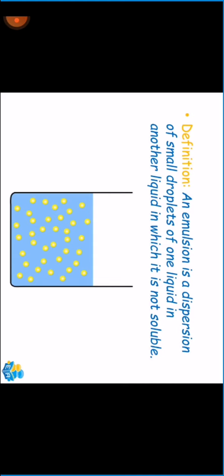It's also important to know the principle of steam distillation, and the principle of steam distillation is that a mixture of two immiscible liquids boils at a temperature below that of the boiling point of each of the liquids. The hot mixture of water vapour from the steam and the oil from the plant, or from the cloves that we're going to use, is passed through a condenser, and the distillate is collected. And that distillate that is collected is a mixture of oil and water. And this mixture of oil and water that we collect has a name, and it's called an emulsion.